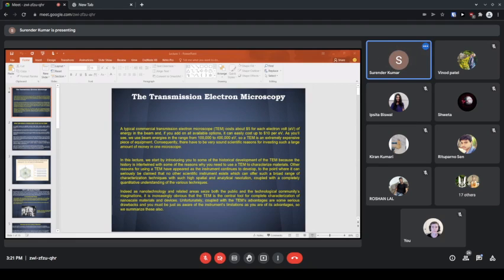For example, if you have a low Z number material, such as any kind of oxide, or you have, for example, gold, in the electron microscope you can clearly distinguish between low Z material and high Z material, because those with high Z have a different electron density. So when electrons pass through them, they behave differently. It will appear dark as compared to the low Z material.